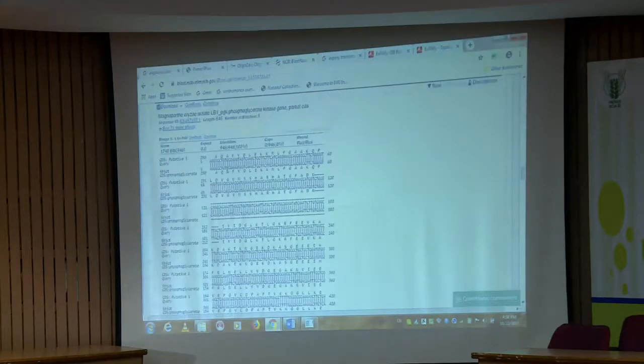Can you see that it is highlighting the translate of this region on top of this? Then accordingly you can match the translate from there and pick that one. Got it?